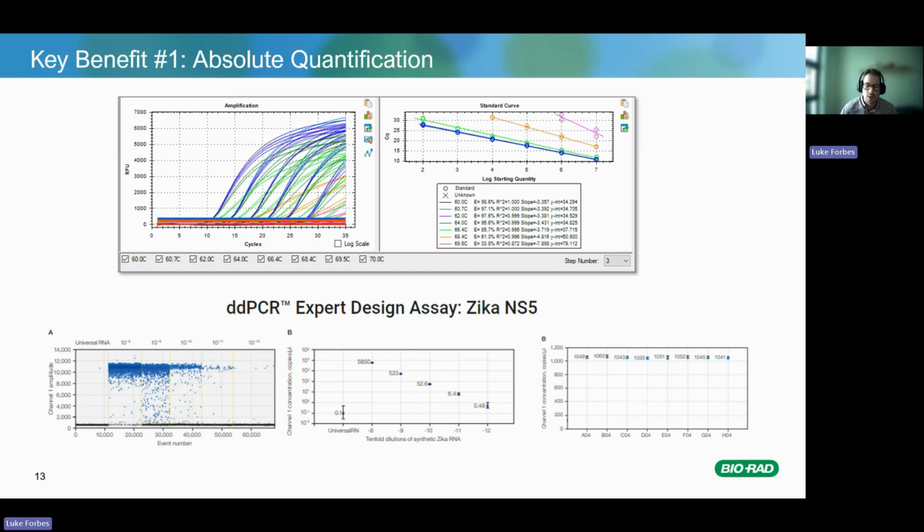And you can also see how well the assay is optimized on ddPCR. On the right there, a gradient was run just like you can do on real-time PCR. We ran these samples from 55 to 65 degrees across the wells. And in A and H, you can see really consistent results around 1,050 copies per microliter across all the wells. So the effect of assay efficiency is much less noticeable when compared to real-time PCR.